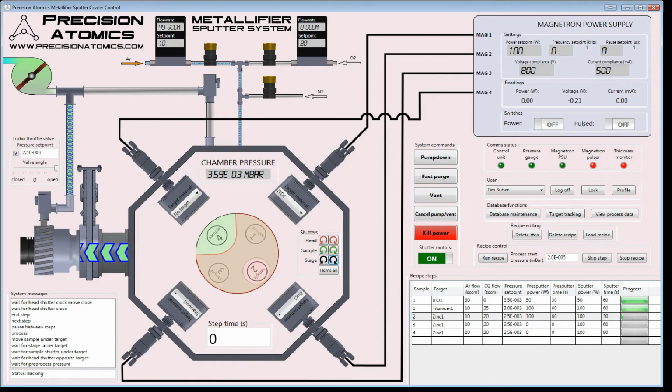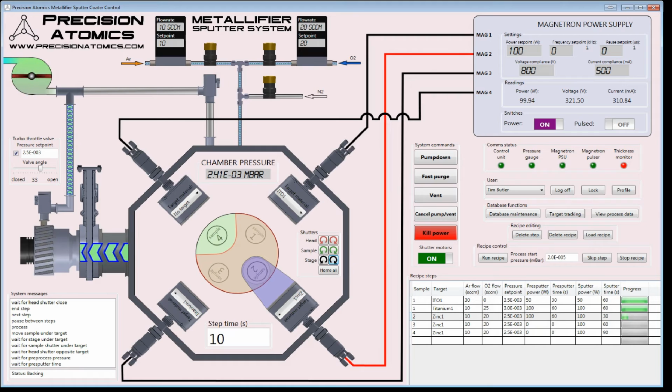In this part of the experiment, 3 quartz samples in positions 2, 3 and 4 will be coated in different thicknesses of zinc oxide to see how the film thickness affects the optical properties. The argon and oxygen flow rates, process pressure and power remain the same throughout the experiment, which varies the exposure time for each sample.